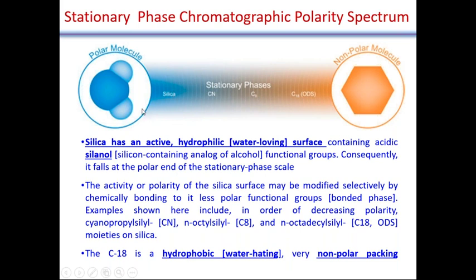Once you know the polarity of the stationary phase, the polarity of the mobile phase, and the polarity of the analytes, you can develop and put together a reverse phase HPLC separation.